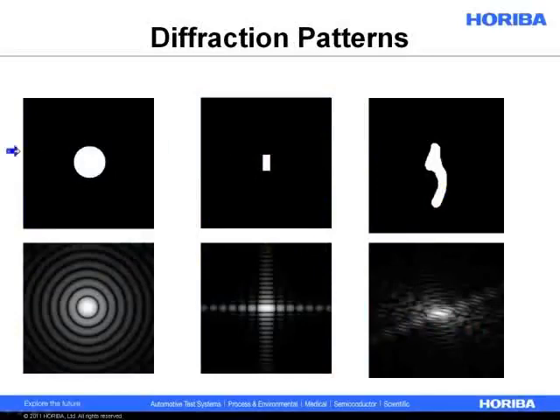So what we're really measuring with a laser diffraction analyzer is a diffraction pattern. We'll also call that a light scattering pattern or a scattered light distribution. There's a lot of different names for it. But it depends on the shape of the particle. We'll talk about that a bit more in a bit too. If you have a perfectly spherical particle, you'll get a very well-behaved, very nice-looking diffraction pattern. If you have a very well-behaved rectangular prism, you'll get another well-behaved diffraction pattern.